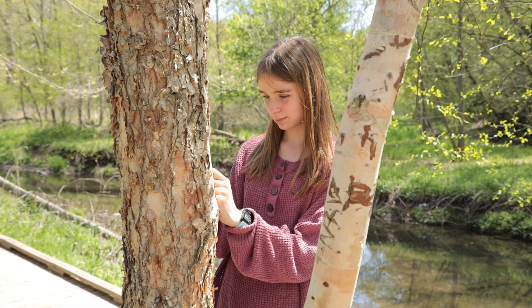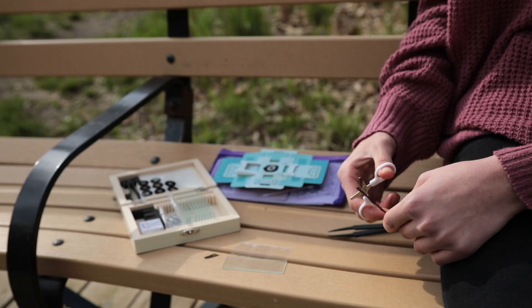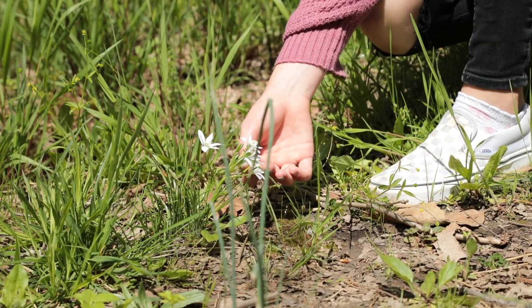Collect a field sample using tweezers and a Ziploc bag. Field samples can be a piece of plant, fungus, insect wing, or feather. Take a walk and see what you can find. Each time can be different.